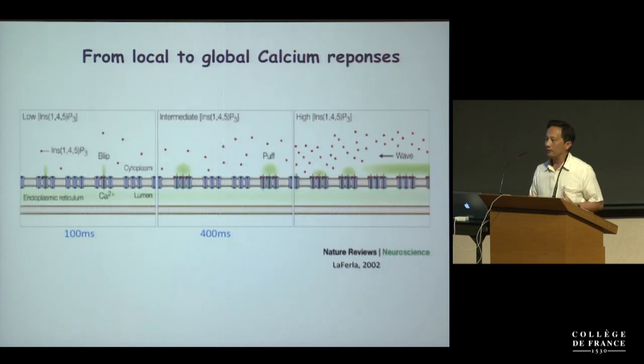With the advent of calcium imaging techniques, and here I'm referring to the advent of fluorescent probes that allow single-cell imaging, we know much more about calcium. The fluorescent probes are the ones developed by Roger Tsien, which earned him the Nobel Prize, among other things, and I don't believe that people give the Nobel Prize to just anybody.